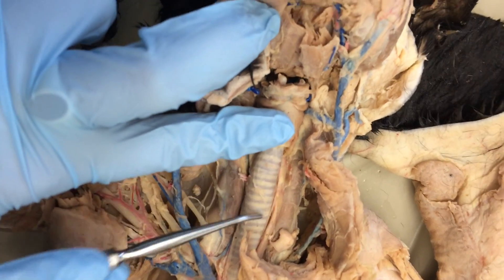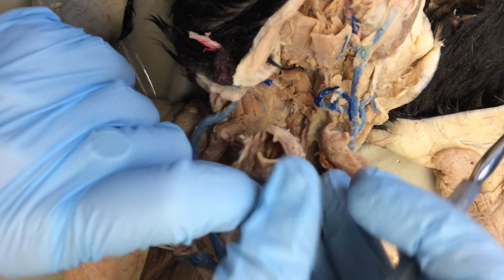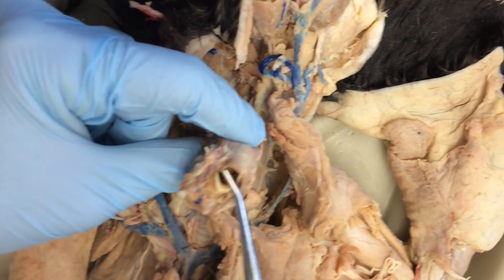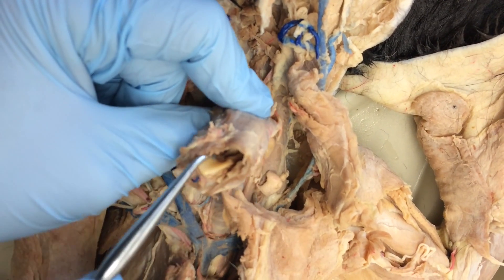The big obvious tube with the cartilage ladder in it is the trachea. If you pull out the trachea, this flap here is the epiglottis. It keeps the flaps closed or open depending on whether the cat's eating or breathing.